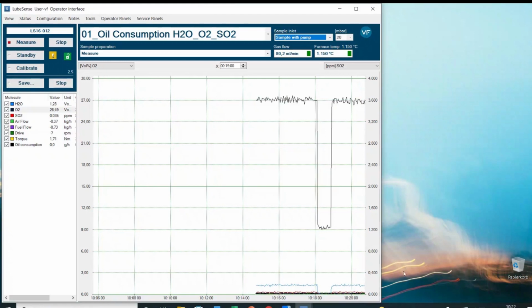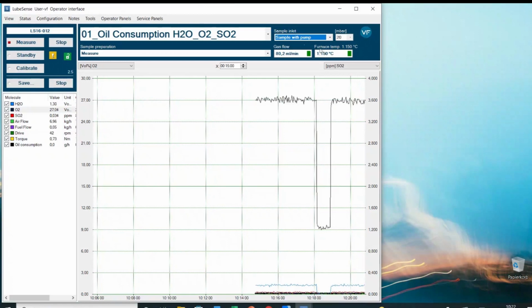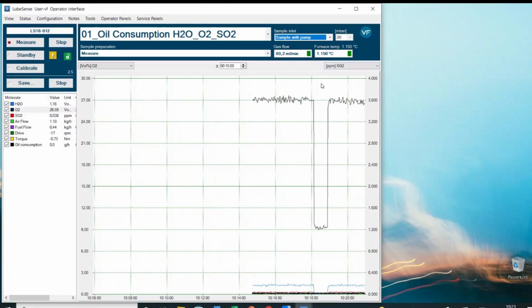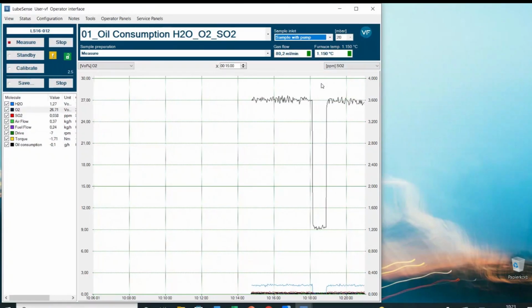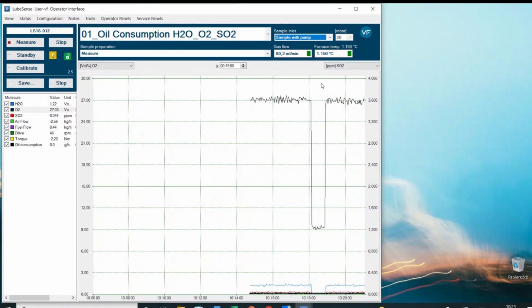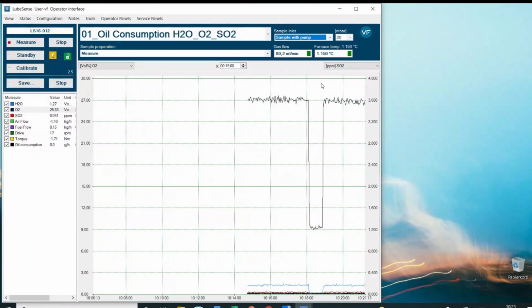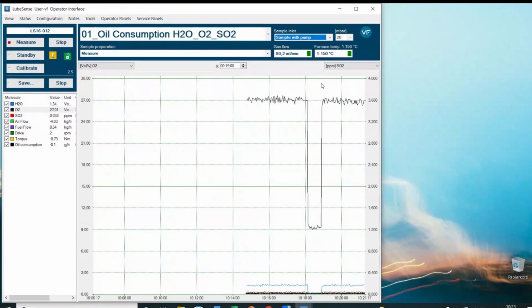Can maybe show one more thing. As we see here, we have some information on the gas flow and the furnace temperature. The gas oxidizer itself, on its backside, I will take the camera just briefly and move you around. As you see here, there is also a small touchscreen on the gas oxidizer, which when you double tap it will show you an overview of the system.